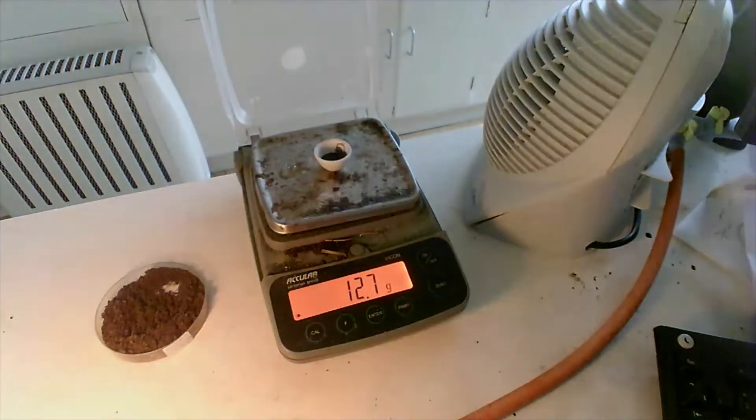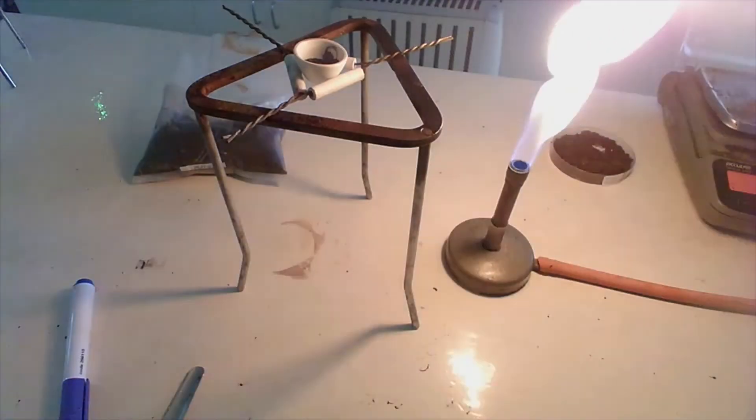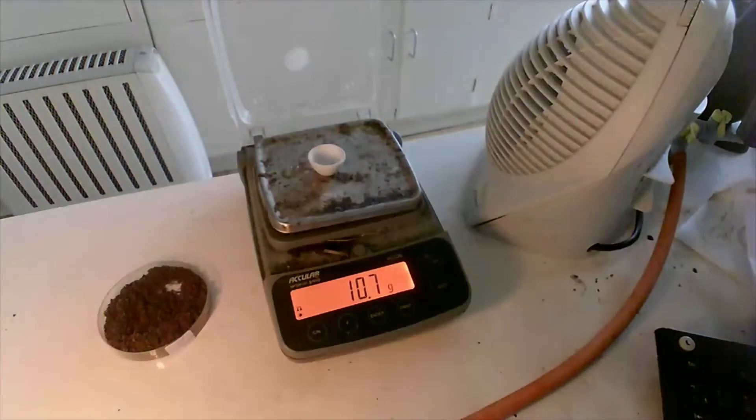The mass of that one at the end was 12.7. So for the next one, I'm getting the mass of this crucible — this one is 10.7 — and I'm going to add in some of the peat sample into this one.